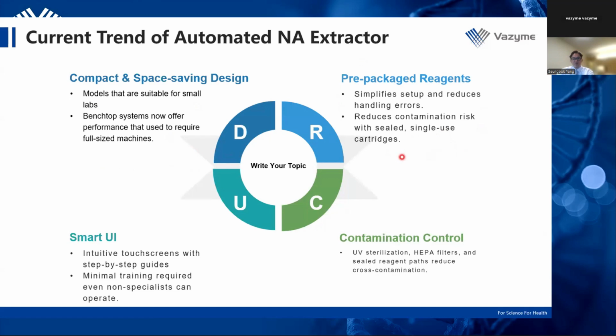Additionally, we're seeing the rise of pre-packaged reagents. These sealed single-use cartridges not only simplify the setup, but also minimize handling errors. Most importantly, they significantly reduce the risk of contamination.